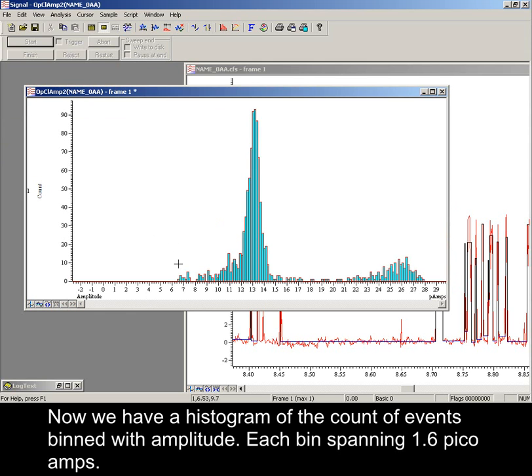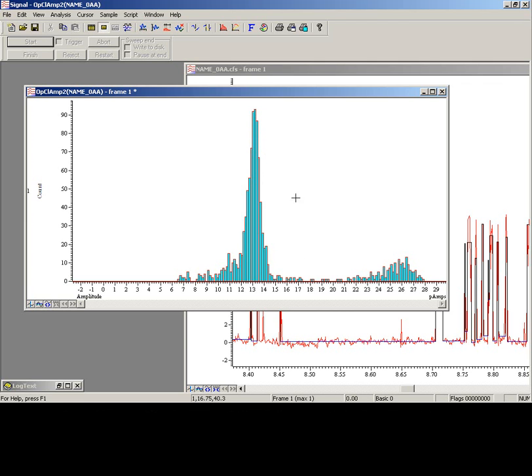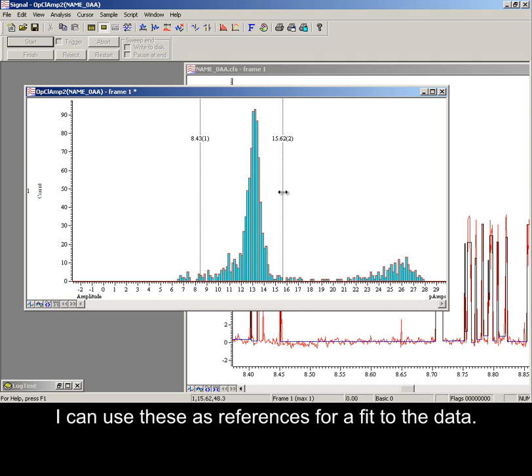Now we have a histogram of the count of events, binned with amplitude, each bin spanning 1.6 picoamps. Adding two vertical cursors now, I can use these as references for a fit to the data.